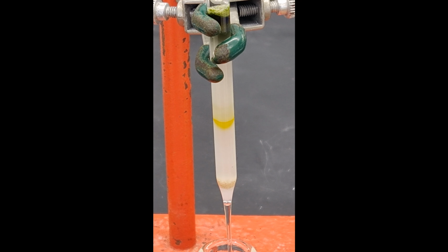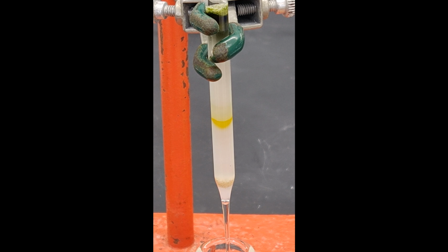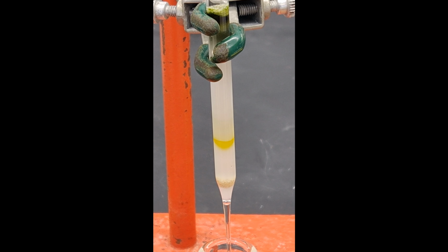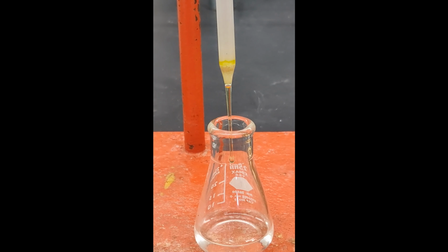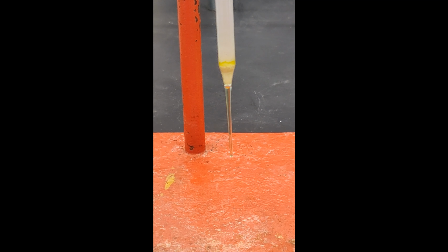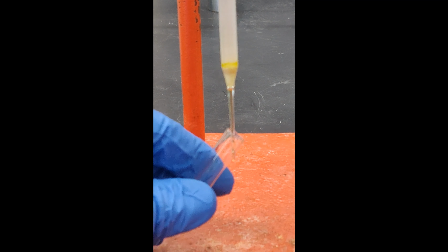If the yellow band has eluted down the column by gravity in a relatively tight band, as in this example, you can use the pressure from a rubber bulb to make it elute more rapidly once the band has reached approximately 1/2 to 2/3 of its way down the column. When the band has reached the sand at the bottom of the column, use the pressure from a rubber bulb to hasten its exit from the column into a small test tube.